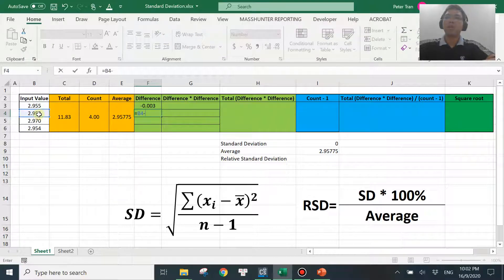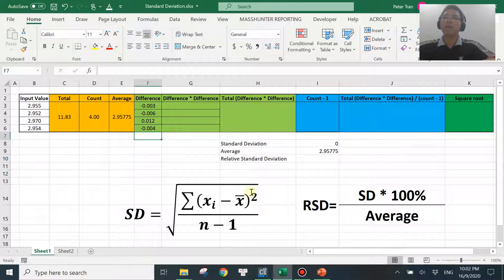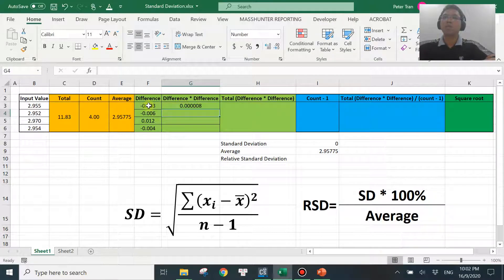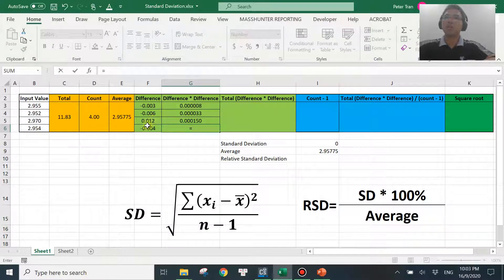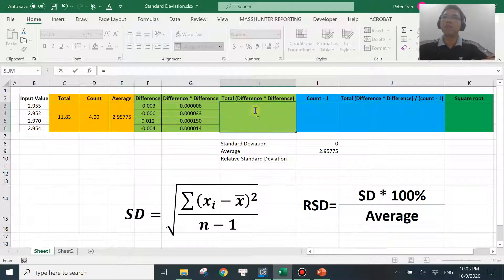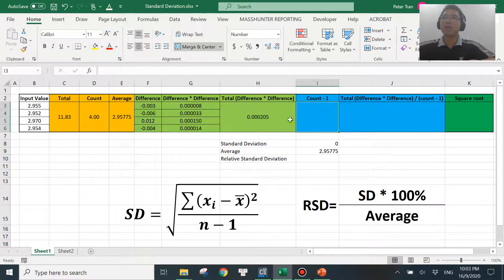Input value minus the average — do this for each value. Then the next step is to take each difference value and raise it to the power of two: H1 to the power of two, this one to the power of two, this one to the power of two, and this one to the power of two. The next step is to sum all of those values: this one plus this one plus this one plus this one.